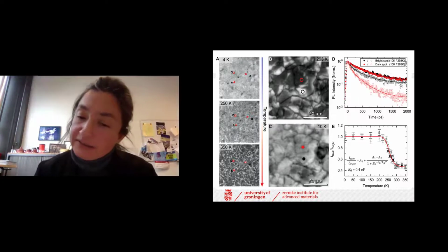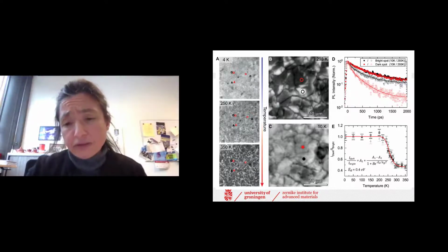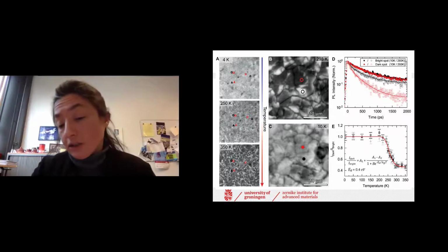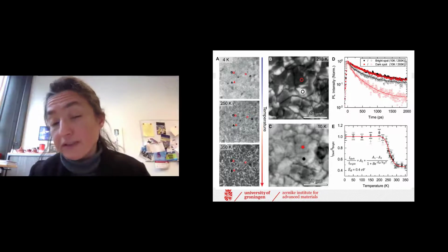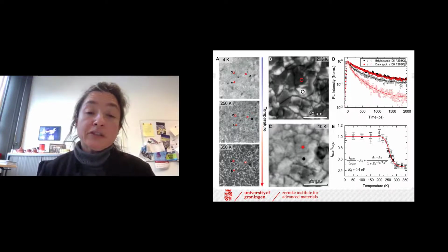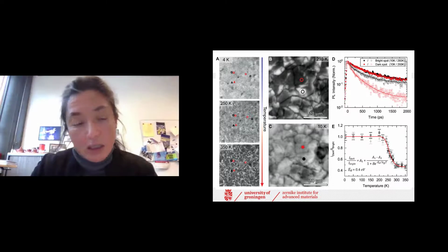Of course, we put this data together, so the ratio of the darker points and the bright points versus temperature. And as you can see, the measurements were done in a very systematic way, and we came up with an activation energy for our dark photoluminescence. The activation energy is 0.4 electron volt. So actually what we are seeing is that at room temperature we have some very effective traps that make our sample dark.